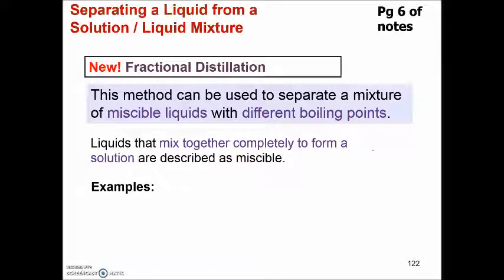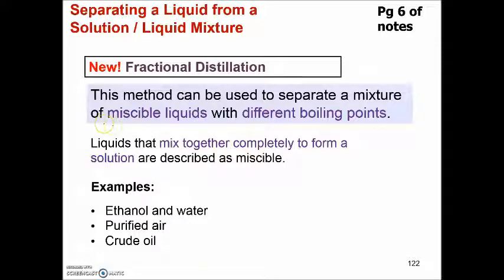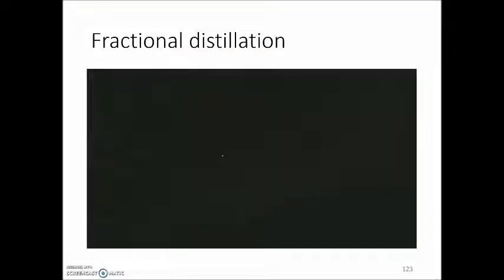And do take note, the liquids are usually miscible. So miscible liquids, like I mentioned before, are liquids that mix together. Now we'll learn how to separate immiscible liquids later on. So let's take a look at this video that shows the principle behind fractional distillation.